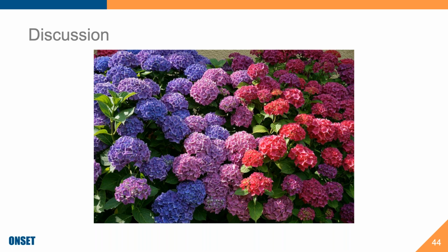Yeah, I don't know what that means. Does algae growth affect the pH? Yes, it definitely does. So this is going to go back to the importance of your interval for maintenance, and it will depend on your specific application. If the algae is growing in 3 weeks, I would recommend going every 2.5 weeks to prevent the algae from growing and making sure you have good data.